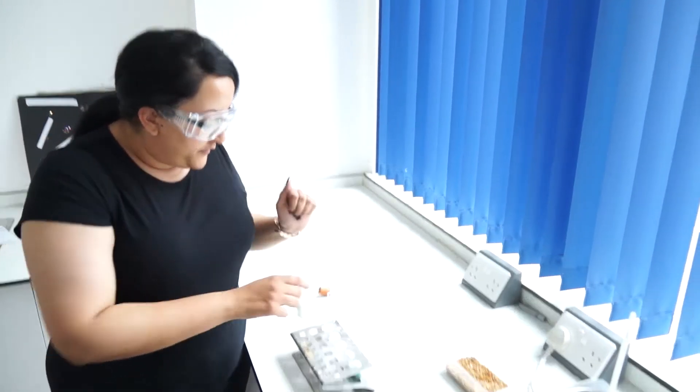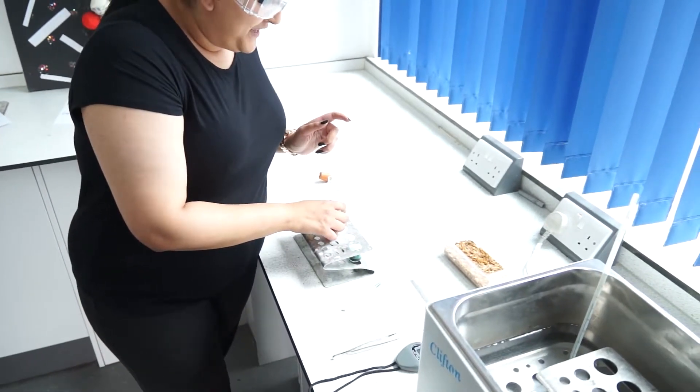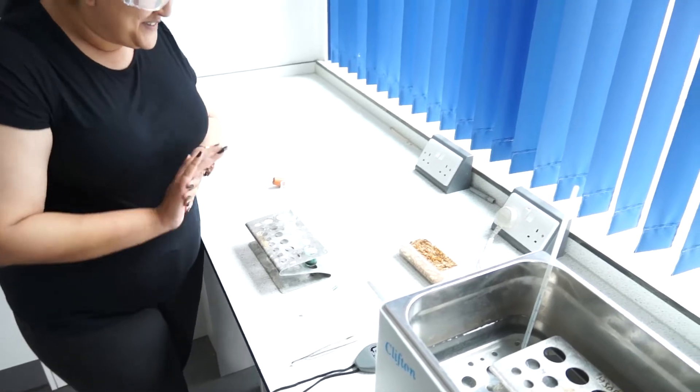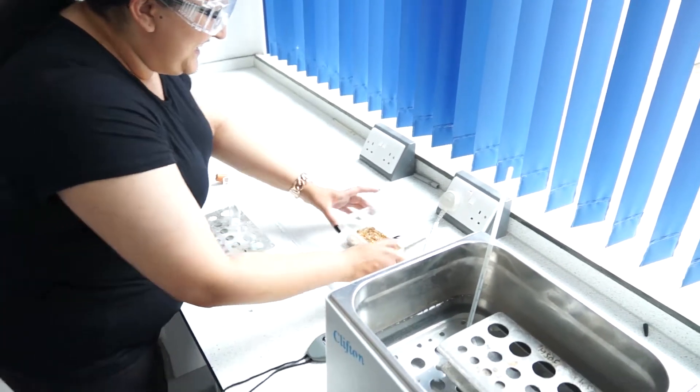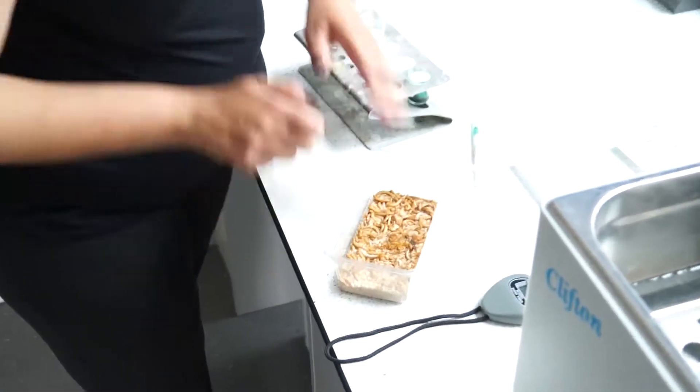First, on top of the soda lime and cotton wool, you are going to place some mealworms. Some of them may be dead and some not so much.